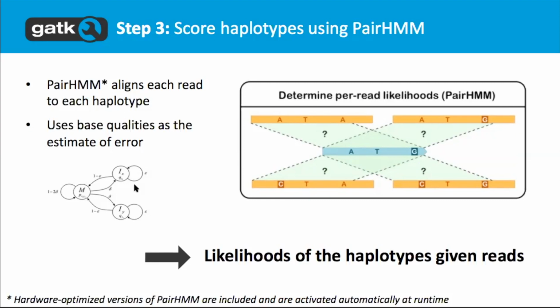Going back to the original reads, coming out of the graph we have a preliminary score based on how much support we had for nodes in the graph, but that's a rough score just for the purpose of handling cases where we have more than 128, which is the current cutoff. If we have more than that, we only want to take the top haplotypes. That's just an optimization to avoid getting too bogged down in too many possibilities that are not real possibilities. But that's a rough scoring.